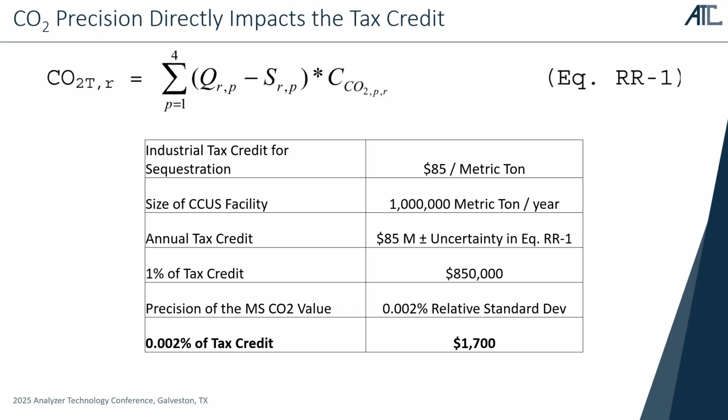Second part of your question, in terms of dealing with interferences, direct mass spec as an industrial analytical technique has been around for many decades. And what you want to do is work with the vendor for that particular mass spec to ensure that they know what you want to measure and how they're going to go after it. Then they'll let you understand, like for example the water case with the CRDS, anything that you probably don't want to measure with the mass spec, they can help you identify that, and if you need to, they would design around those interferences.